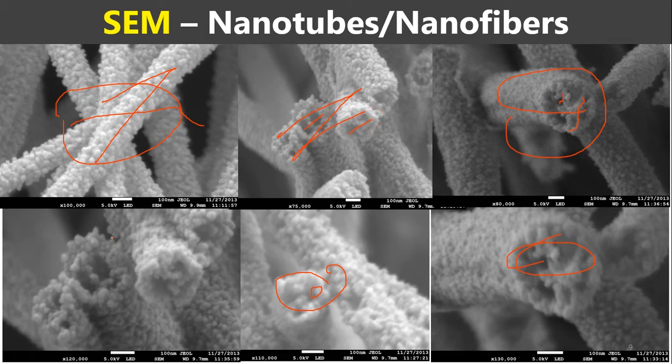These are basically the SEM images. So what I want to focus here is that we cannot go for high resolution, otherwise the image will get blurred. Here you see, we maximum reach to 100 nanometers. Below maximum we can come to 50, but below that we cannot come.